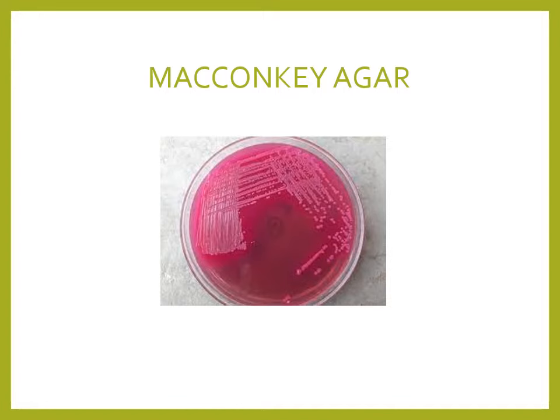An important point: when we see MacConkey agar we can usually identify it, but sometimes there is confusion between blood agar and MacConkey agar. Although blood agar is deep red, sometimes the colors can look similar. The trick is to hold the plate and look through the media — MacConkey agar is transparent, whereas blood agar is not transparent because it contains intact RBCs.